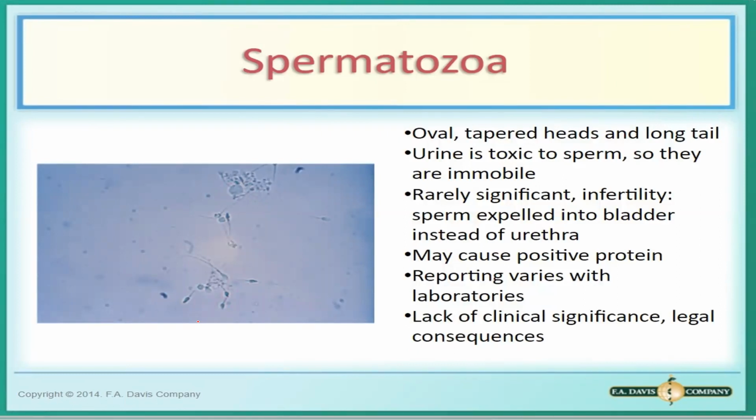Miscellaneous constituents, number 1, we have spermatozoa. Sorry, I forgot. Sa epithelial cell po pala ang reporting ng squamous and transitional epithelial cell is semi-quantitatively: rare, few, moderate, many. Si RTE cell, it is average per high power field. Okay. Next, we have spermatozoa.